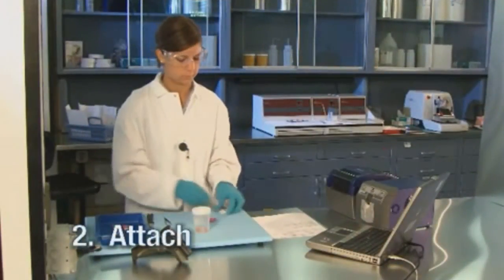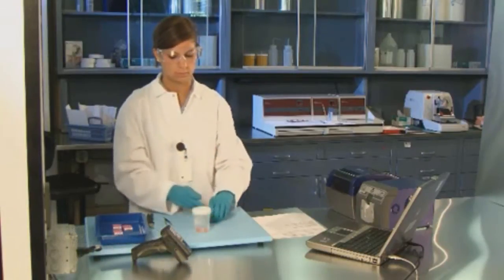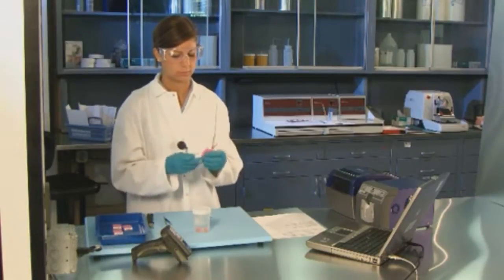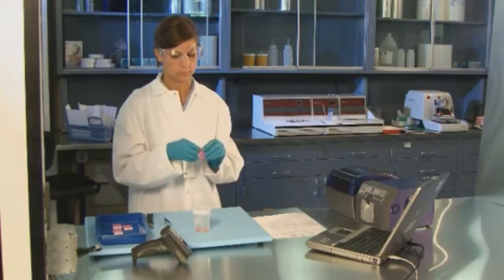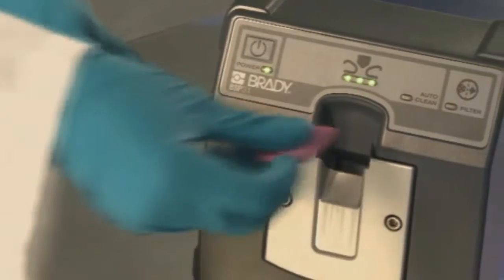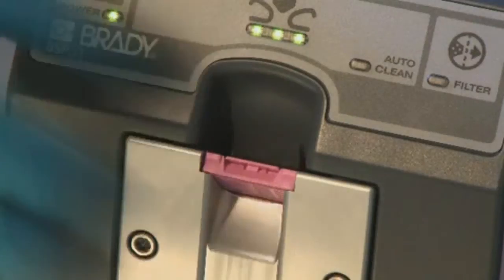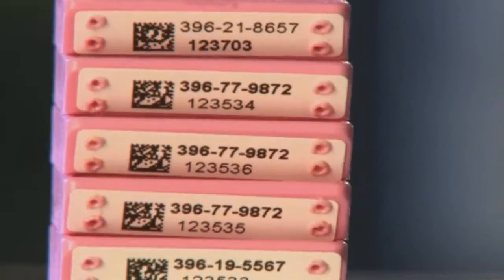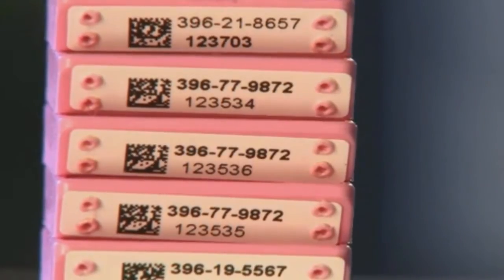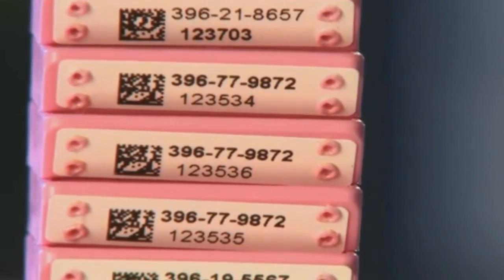After the labels have been printed, place the label onto the cassette and insert it into the Brady BSP31 label attachment system. The BSP31 system will mechanically fasten the label to the cassette through a revolutionary heat-staking process that permanently bonds the two pieces together with plastic rivets. These rivets provide the durability necessary for the lab labels to withstand tissue process protocols.